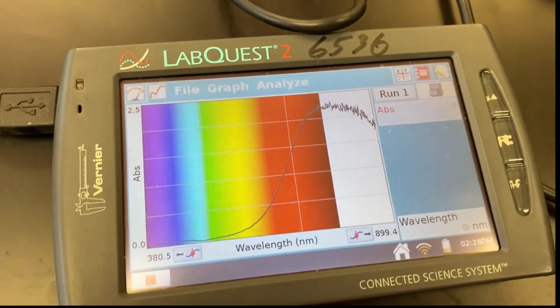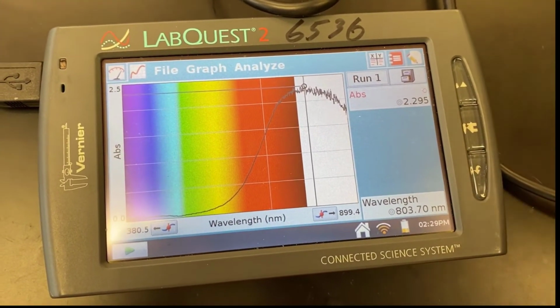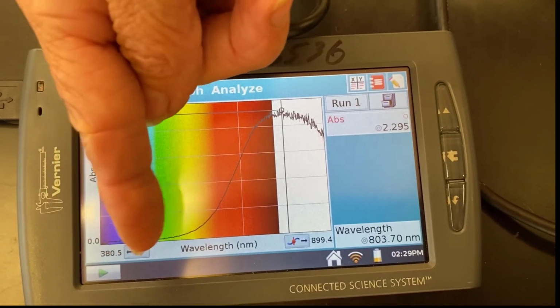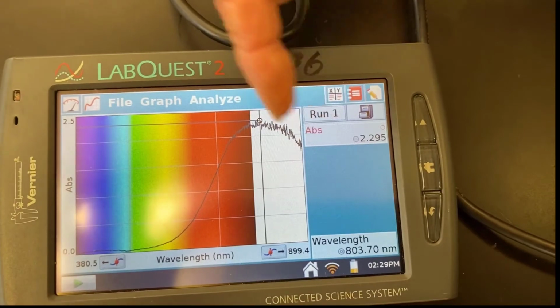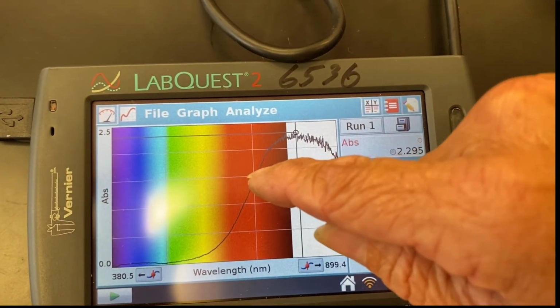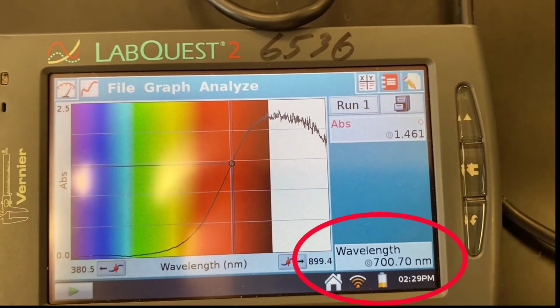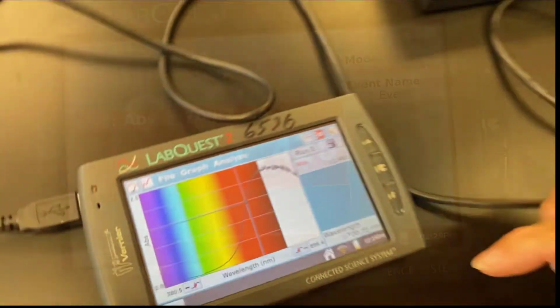Let me stop the reading. We can see our curve here, and what we're looking for is a wavelength of light that is absorbed by the blue solution. Since this is measuring absorption, these wavelengths are not absorbed. There's very little. And up here they are absorbed. But this is where my SpectraVis can't read very well, so I'm going to pick a wavelength in here somewhere. Let's see if I can move to maybe there. That's probably a good wavelength, and it says that that is about 700 nanometers. So we're going to do all of our readings at 700 nanometers, okay?